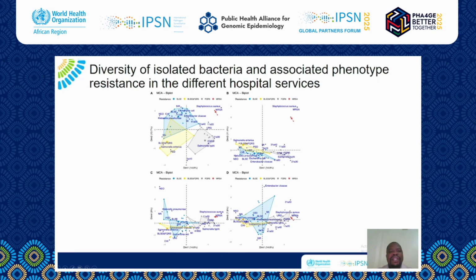And we have already identified resistant genes associated with those different bacteria that are isolated, and this is mostly for patients above 40 years old.